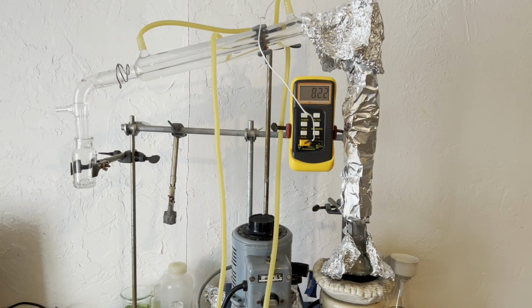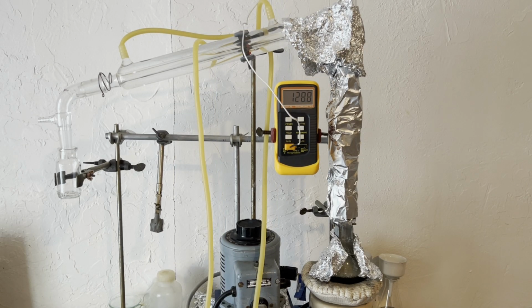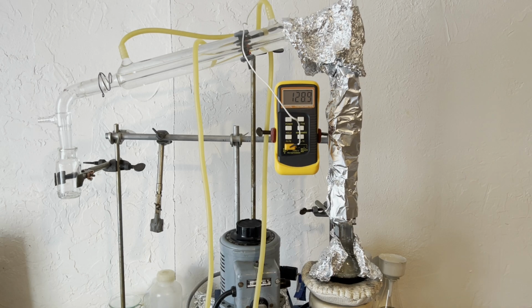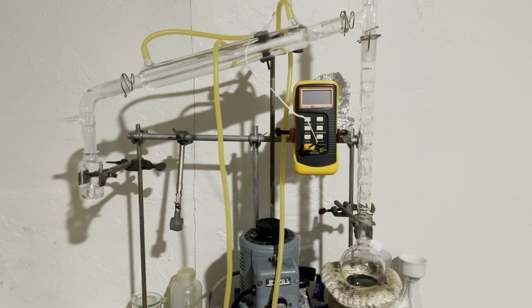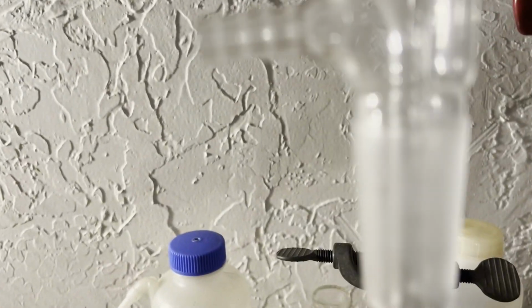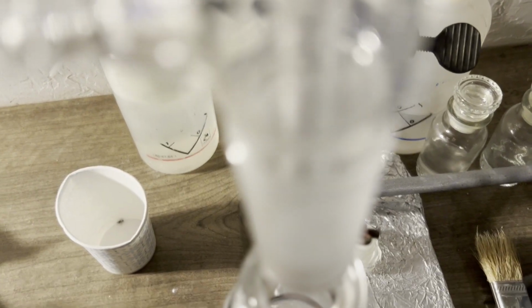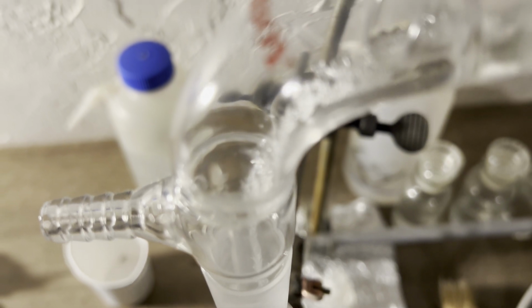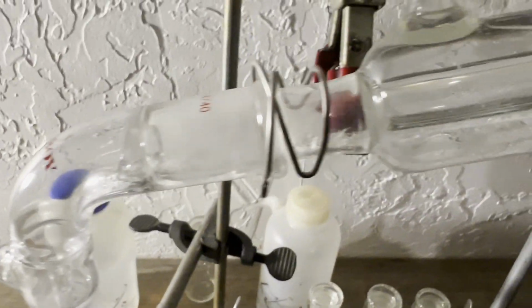I collected 4 main fractions: one up to 80 degrees, which was mostly DCM and a little benzene; one between 80 degrees and 128 degrees, which was mostly benzene and a little chlorobenzene; one between 128 and 150 degrees, which was mostly chlorobenzene; and the last one between 150 degrees and 180 degrees, which was ortho and para DCB, but probably some chlorobenzene too. O and P DCB boil at 180 and 174 degrees respectively, so they can't really be separated by fractional distillation on this scale.